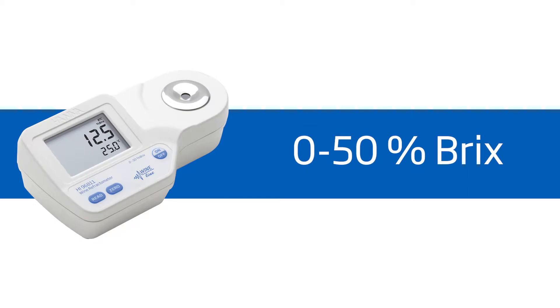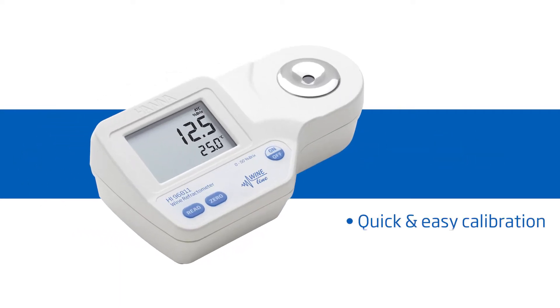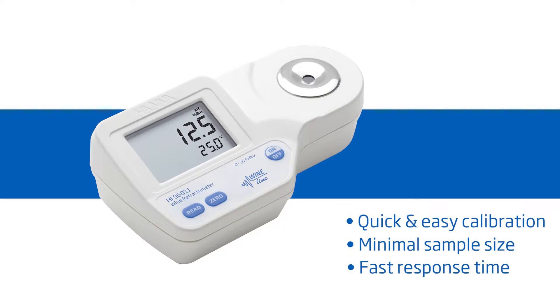Welcome to the HANA Lab. My name is Doug and today we'll be featuring the HANA HI-96811 Refractometer for percent Brix in must and juice. It offers high performance and eliminates uncertainty involved with mechanical refractometers, all at around $175. It features one-button calibration, two-drop sample size, and a 1.5-second response time. HANA Instruments provides you with the necessary tools to succeed.